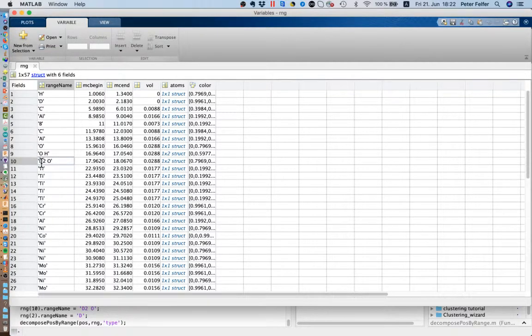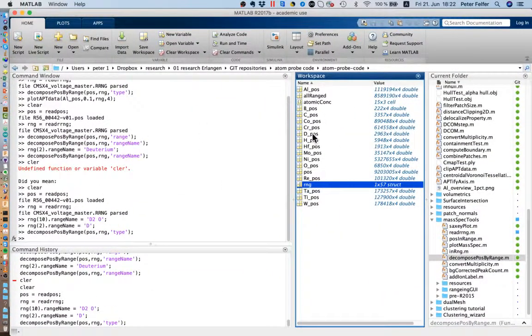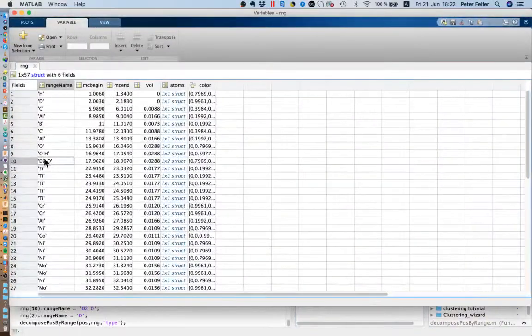It will find those. And we'll say, okay, this is a range with deuteriums and one oxygen atom. And it will take care of that and give us a D.pos, which actually contains two copies of this range, shifted by a certain margin, so that we don't have atoms sitting on top of each other, which for numeric reasons can be bad, and takes the deuterium out of this range, okay?